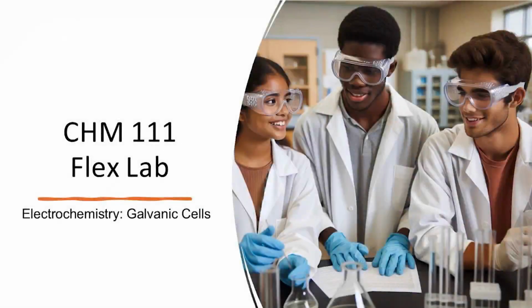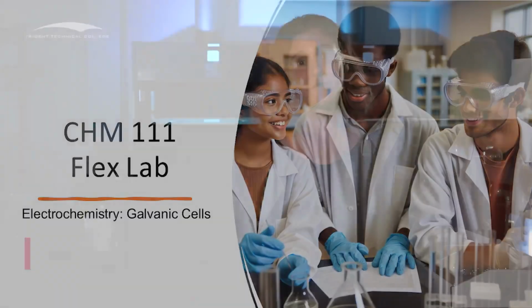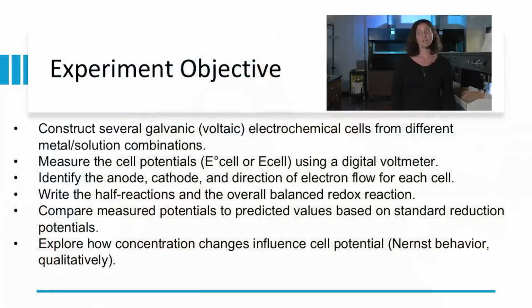Hello, and welcome to the CHEM111 Flex Lab on electrochemistry galvanic cells. In this experiment, we're going to construct several galvanic cells with different metals and solution combinations.